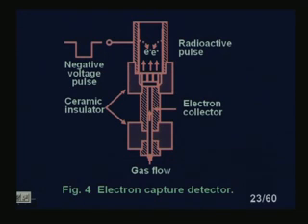Now, the particular radioactive sources which are used are tritium adsorbed in titanium or scandium, and nickel 63 as a foil or plated on the interior of the cathode chamber. Tritium sources have a high specific activity, giving a large standing current and a high sensitivity, but the beta energy is so low that the source is extremely susceptible to contamination. The maximum working temperature is 225 degree centigrade. Now, nickel 63 is a higher energy source and can be used up to 400 degree centigrade.